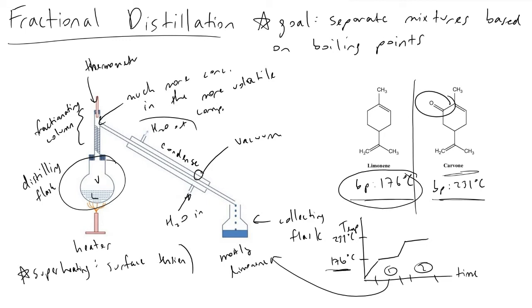And so this fractional distillation is essentially what you need to know to do benchtop distillation in an organic chemistry lab. And people sometimes will call simple distillation just not having this fractionating column here. So if you don't have this fractionating column and you just go directly from your distilling flask into the condenser, it is just called simple distillation. So they are basically the same thing.